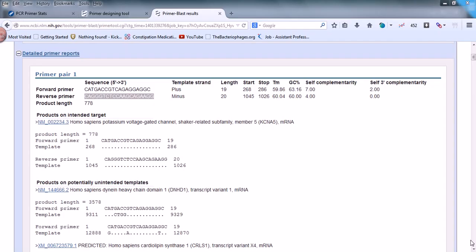Welcome back guys, this is a bioinformatics practical tutorial and we are talking about primer designing. We learned how to design primers using NCBI suite, not using any other software for now. Once you make the primer, if you don't know this, just go back to the first video and look at how we designed the primers.